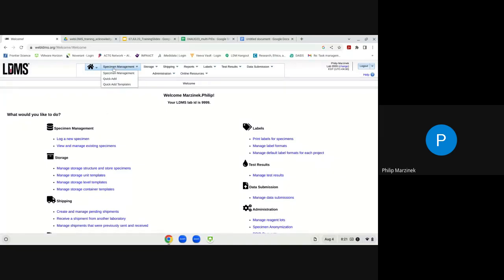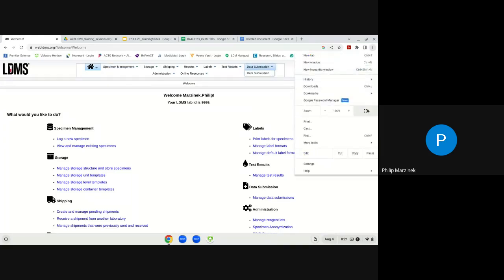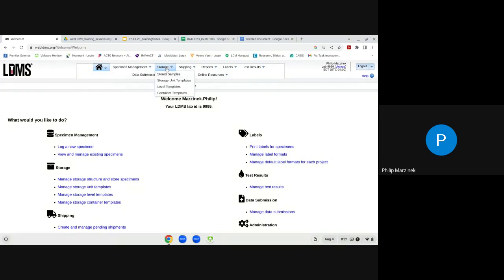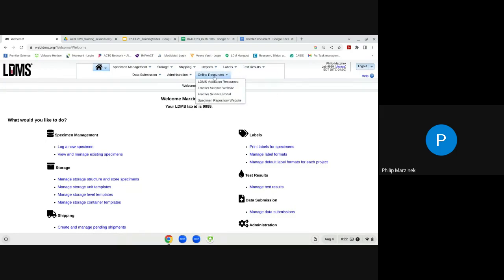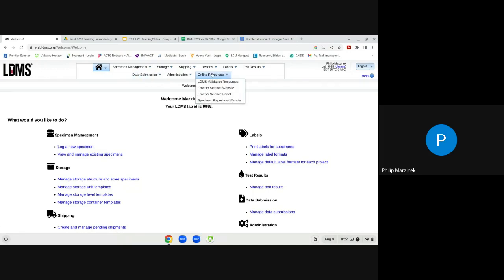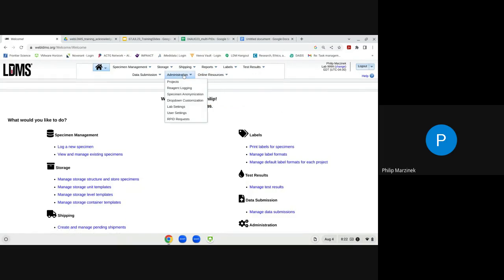Another feature is our navigation pane at the top of the screen. This contains all the different modules: Specimen Management, Storage, Shipping, Reports, Labels, Test Results, Online Resources, Administration, and Data Submission. Online Resources has embedded links for validation resources, the Frontier Science website and portal, and the specimen repository website.